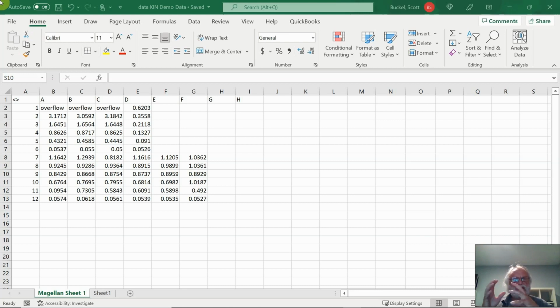What I did is I merged a couple of data sets together to make it a little bit easier to understand the data. So here I'll show you how I would process the data from experiment 9. I will post a video later on experiment 8, and it's a little bit different, but I think for you to start writing your discussion, processing this data is more important at this point.